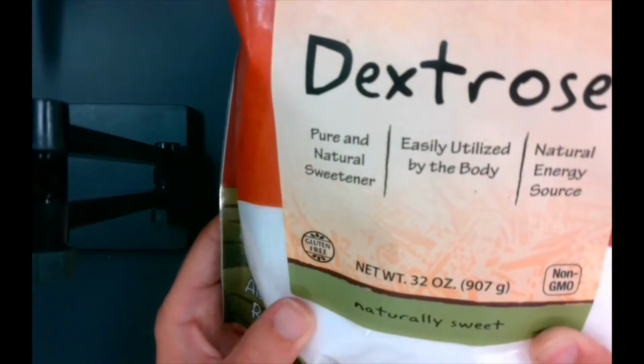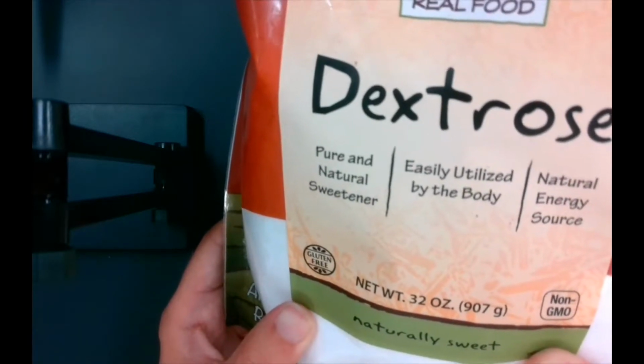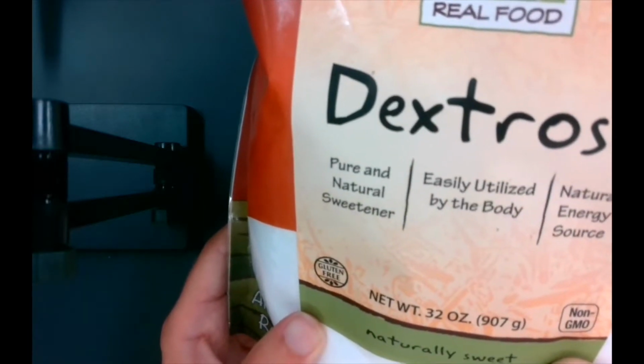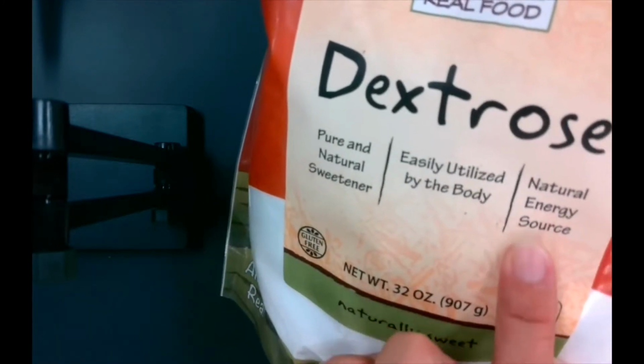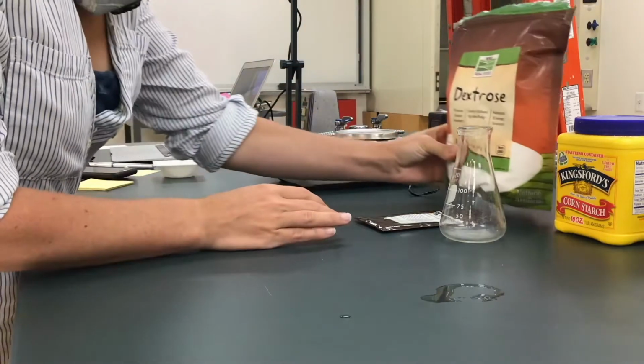Dextrose is the common name for glucose. You can see it's something that you can buy in the grocery store. It's a sweetener. It's simple for the body to use, and of course, as we know, glucose is a natural source of energy. So we're going to put that in our solution.